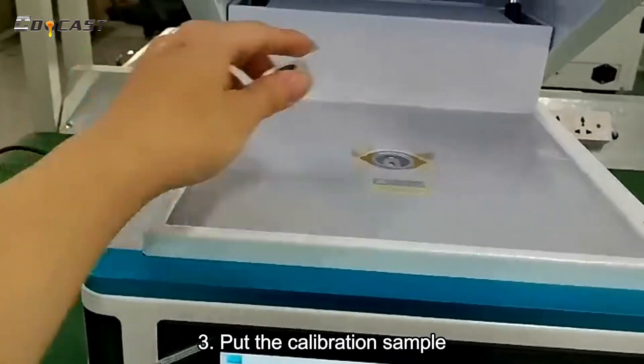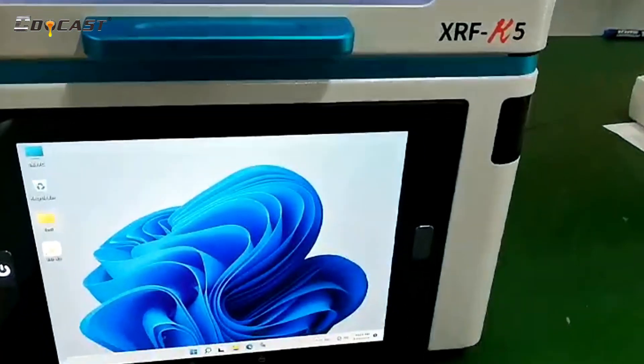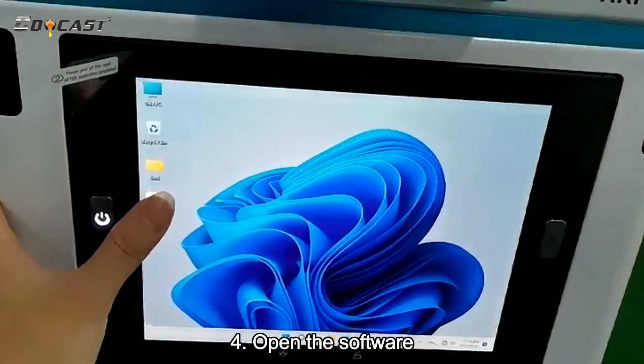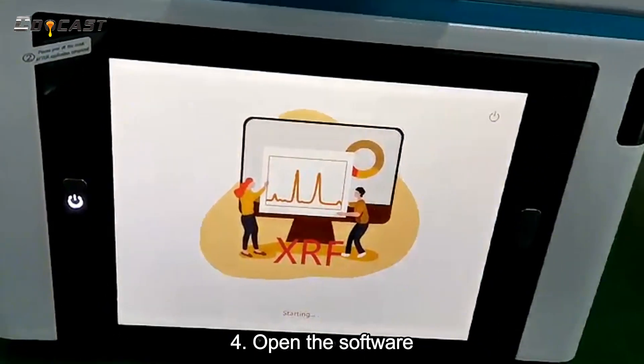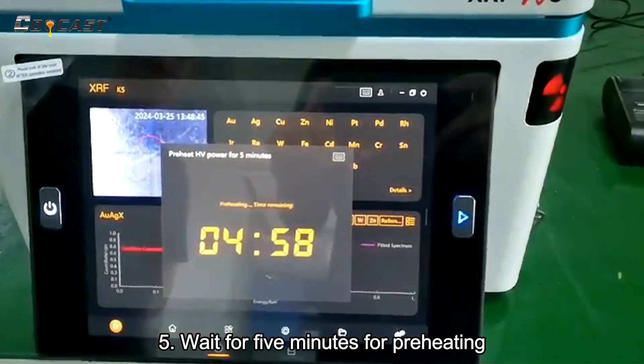Put the calibration sample. Open the software. Wait for 5 minutes for preheating.